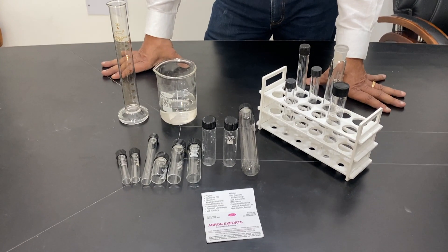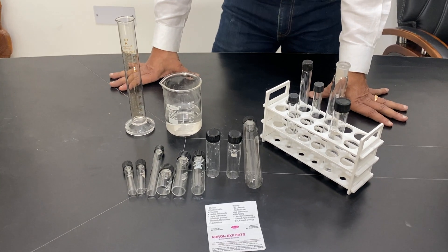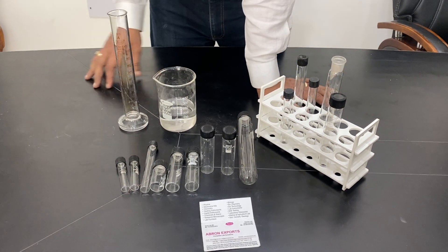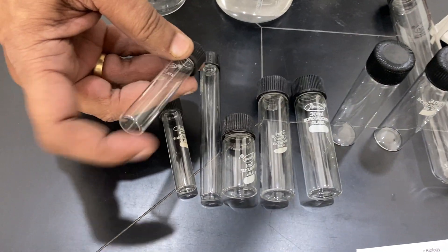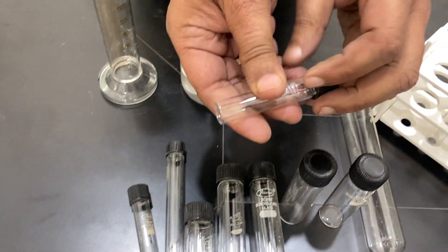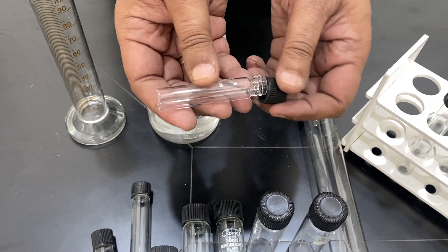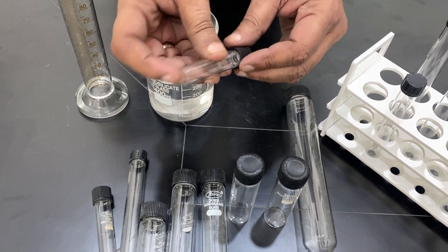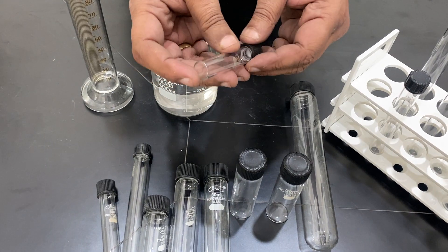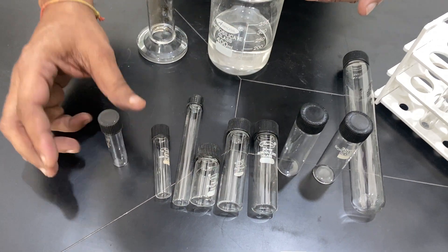Today we will study and see what kind of culture tubes are available with us by the Braumage Board. There are two kinds of culture tubes. One is a flat bottom, with a screw cap. It comes with a screw cap and the gasket is inside — Teflon, and rubber and Teflon. This is the Bakelite part which is autoclavable. This is borosilicate glass with a flat bottom.